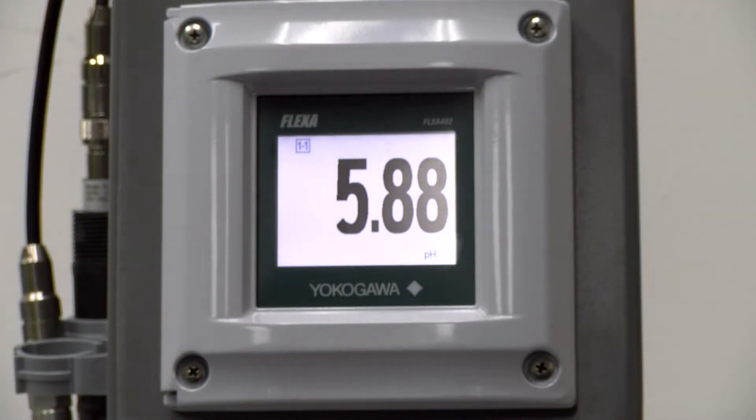Hello, my name is Jordan and I'm here to talk about the OxyGold G Dissolved Oxygen Sensor. In this video, I will show you the setup and calibration of the sensor with the Flexa 402 unit.